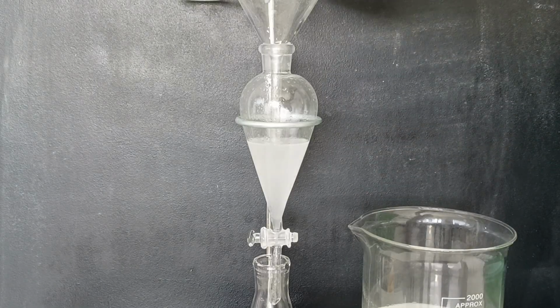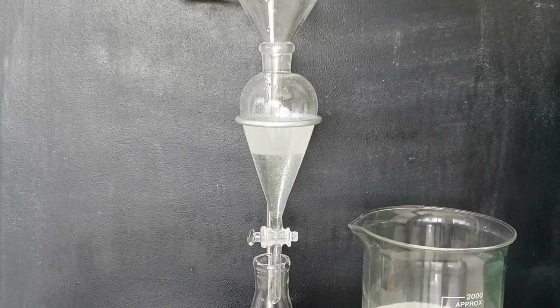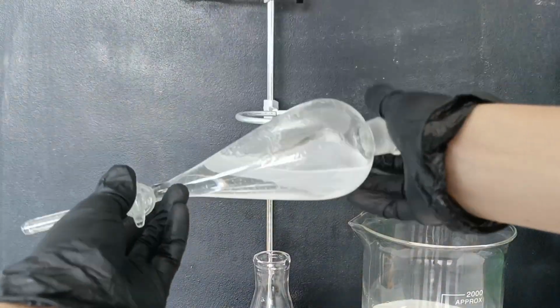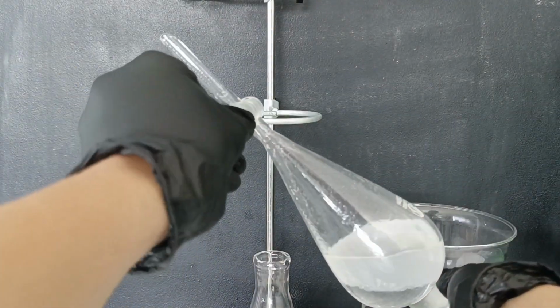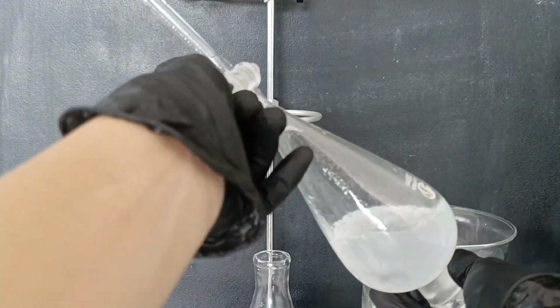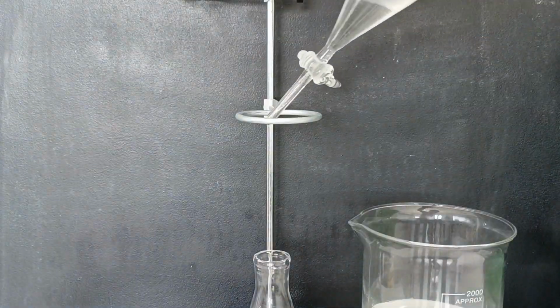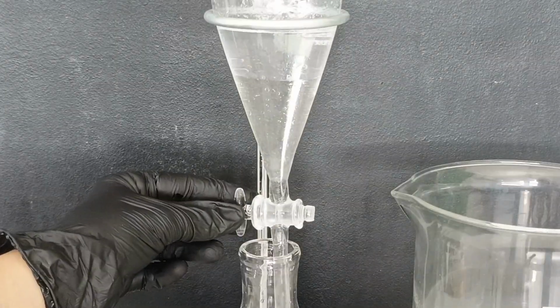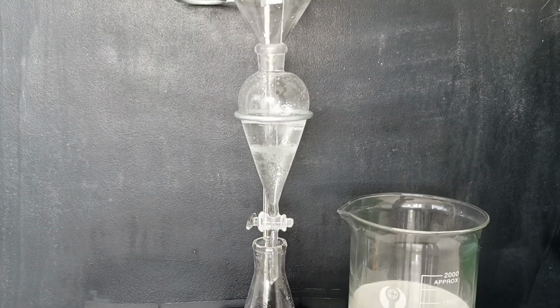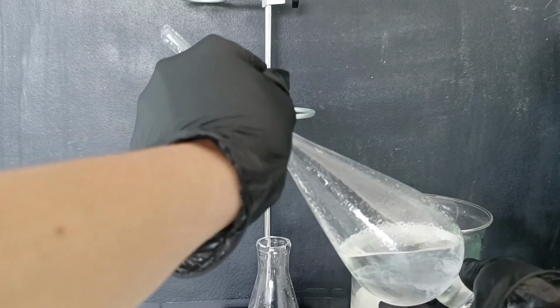To fix this, I added some saturated sodium chloride solution. Again, the separatory funnel was capped, shaken, and vented. You can already see that the organic layer is a lot clearer than earlier. It's still not perfectly clear though, so I added more sodium chloride solution.